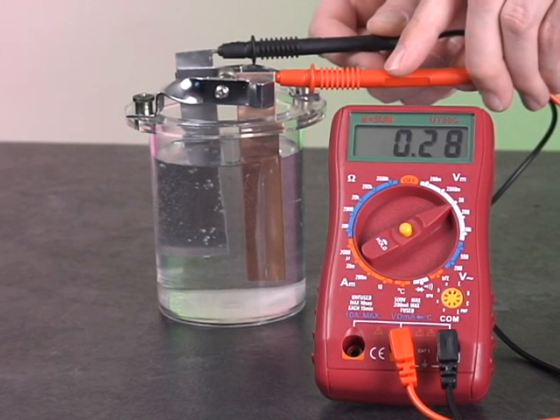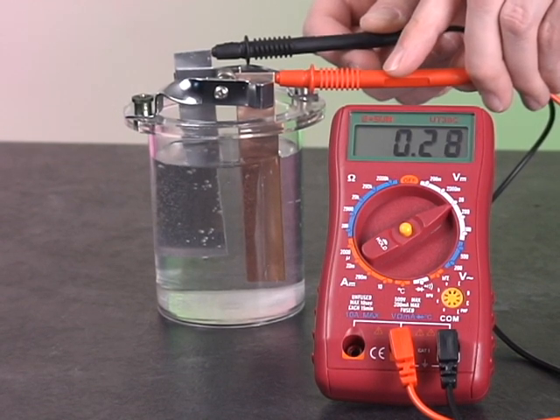Other electrode materials and electrolytes can also be used, and students can determine the most efficient materials. They will have fun creating electricity with this kit.